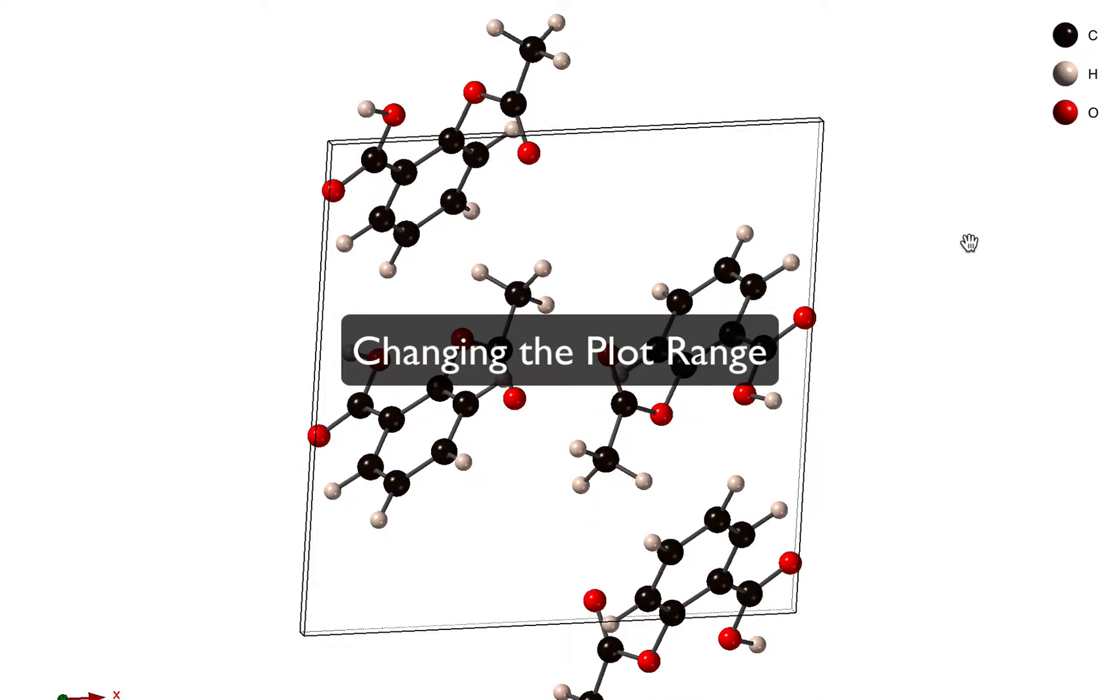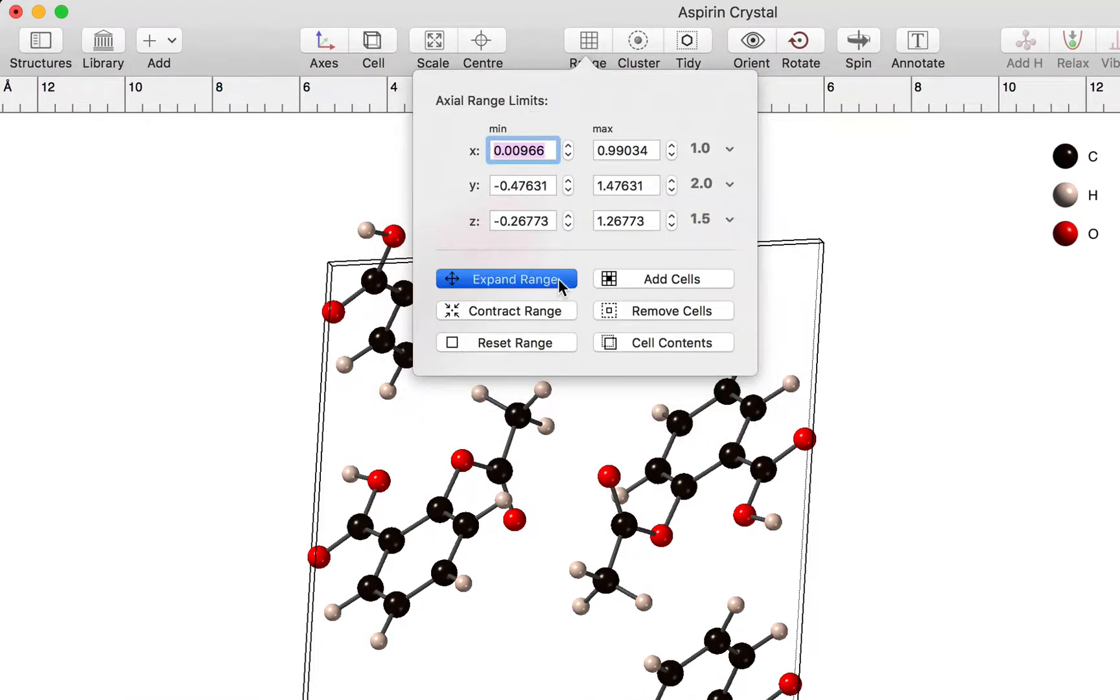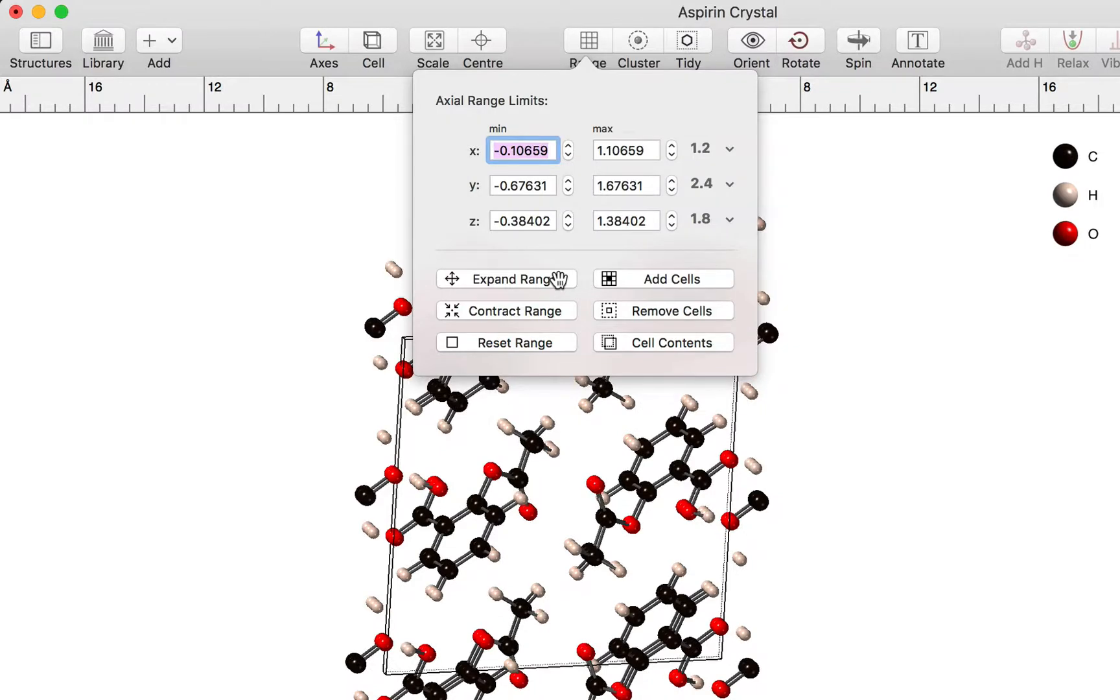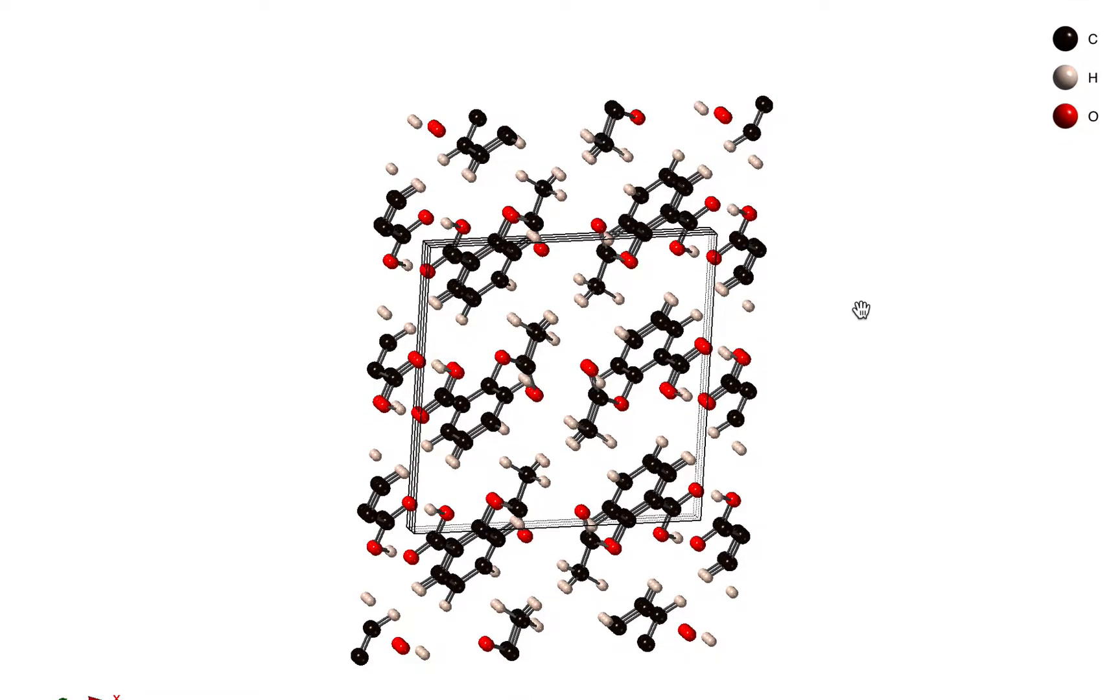Now what happens if you want to display more of the structure? You can do that using the range command. We can expand the range, and when we do this we're displaying all atoms that lie within a box whose shape is the same as that of the unit cell. Obviously as you expand the range you're going to end up with fragments of new molecules.